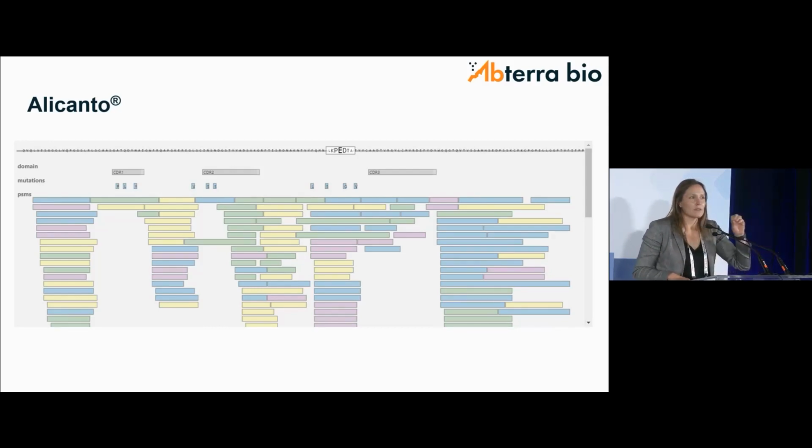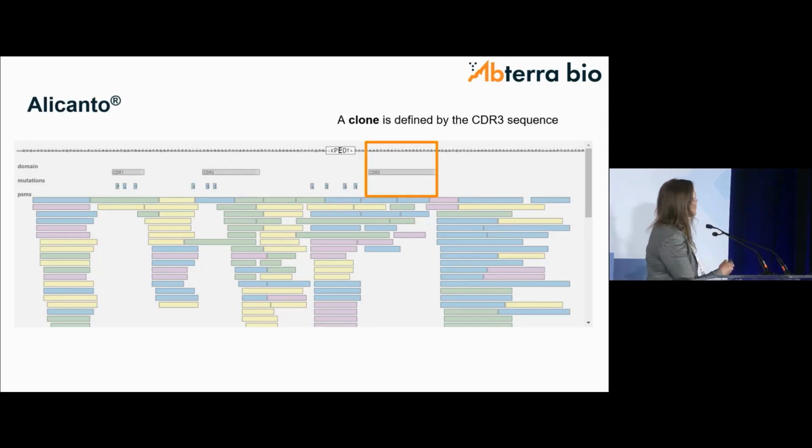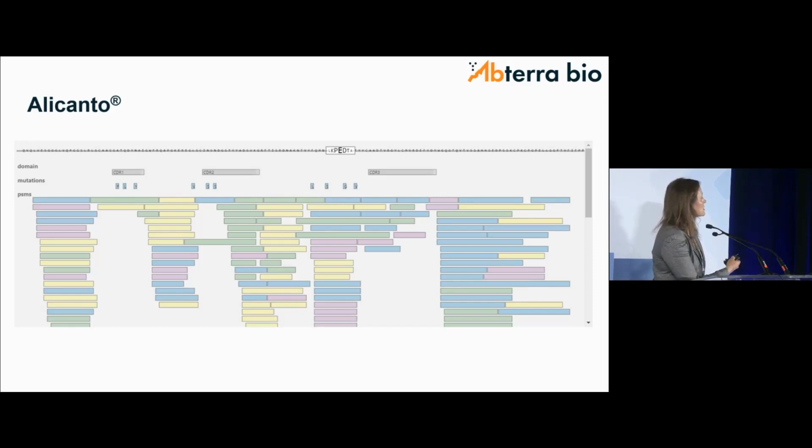So what I'm showing is kind of a genome browser view of an individual antibody that was detected in this project. Along the top, we have the amino acid sequence annotated with CDR1, CDR2, CDR3, and all of the mutations that have been accumulated in this antibody with respect to germline. And then all of these individual blocks are peptides that are mapping to this individual antibody. They were observations that we found in the polyclonal that we pulled out from serum that match this individual antibody. And you can see that they're different colors because we use different enzymes.